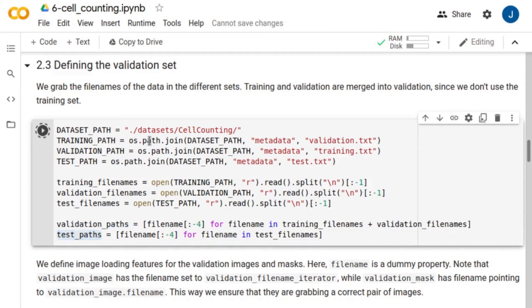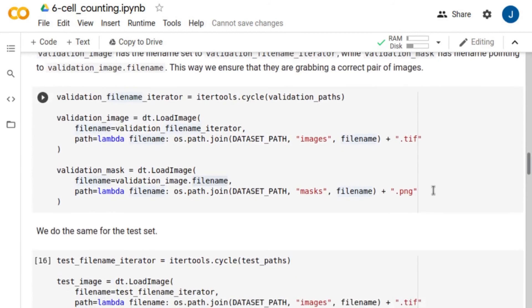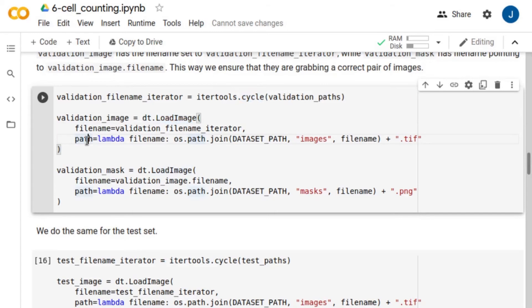Then, we will evaluate the trained model using the test set. Next, we define a cyclic iterator to iterate over the validation files. To read the images, we use the loadImage feature. The input to this method is the path to the image to load. Note that the path to the validation cell images has the filename set to the iterator we defined.